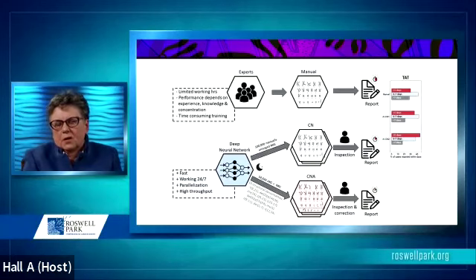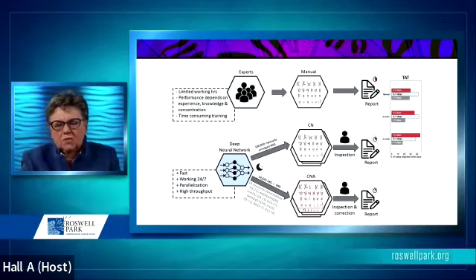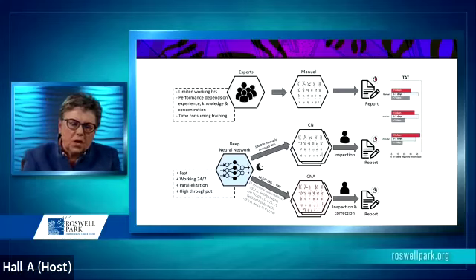This system will record the karyotype in 1 second, allowing then maybe about 30 seconds for that experienced technologist to check the accuracy. They're in the process of doing studies where they're performing training for different structural abnormalities.